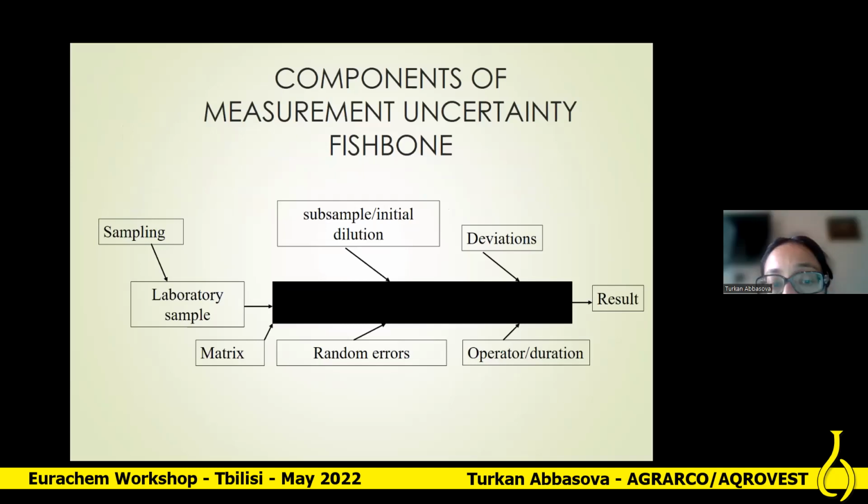Also the matrix, subsample, initial dilution, deviation, operator, duration, and equipment also influence the measurement uncertainty.